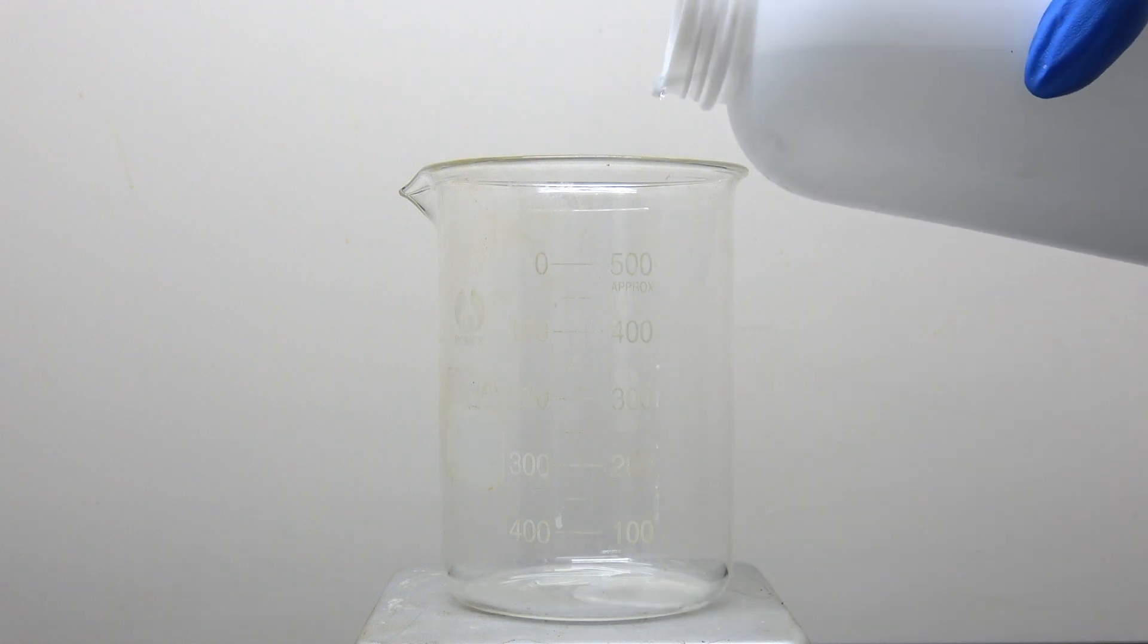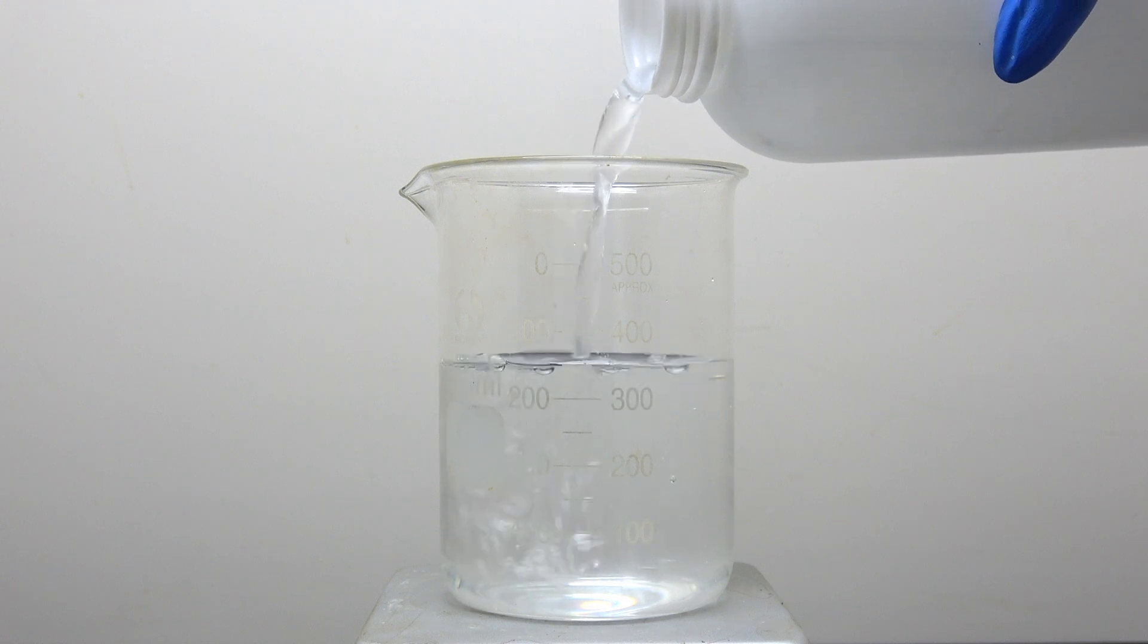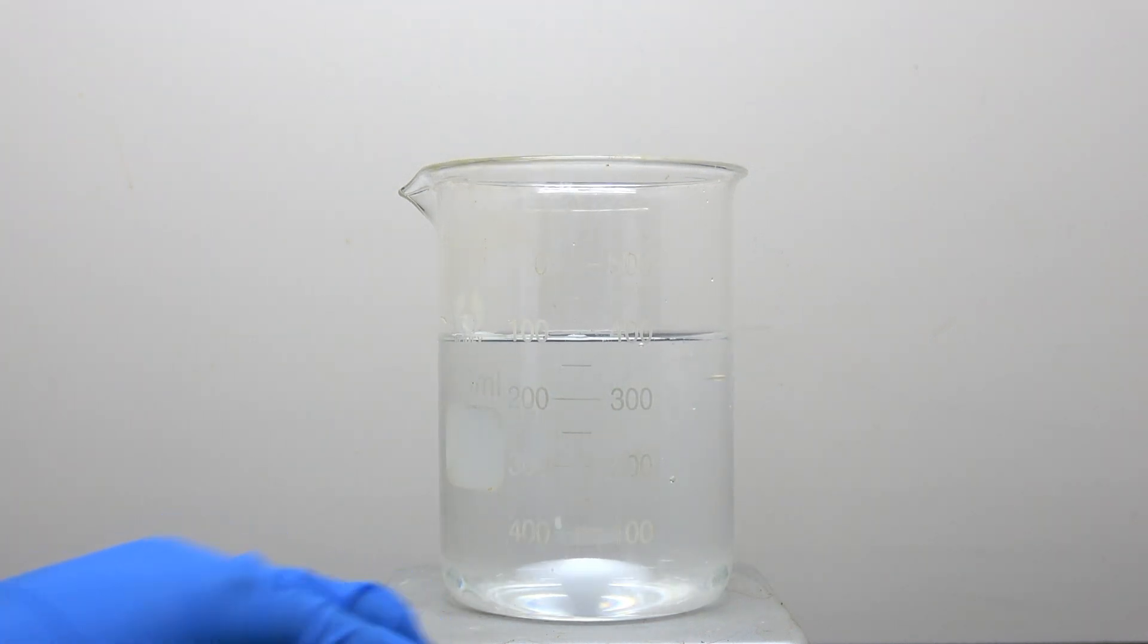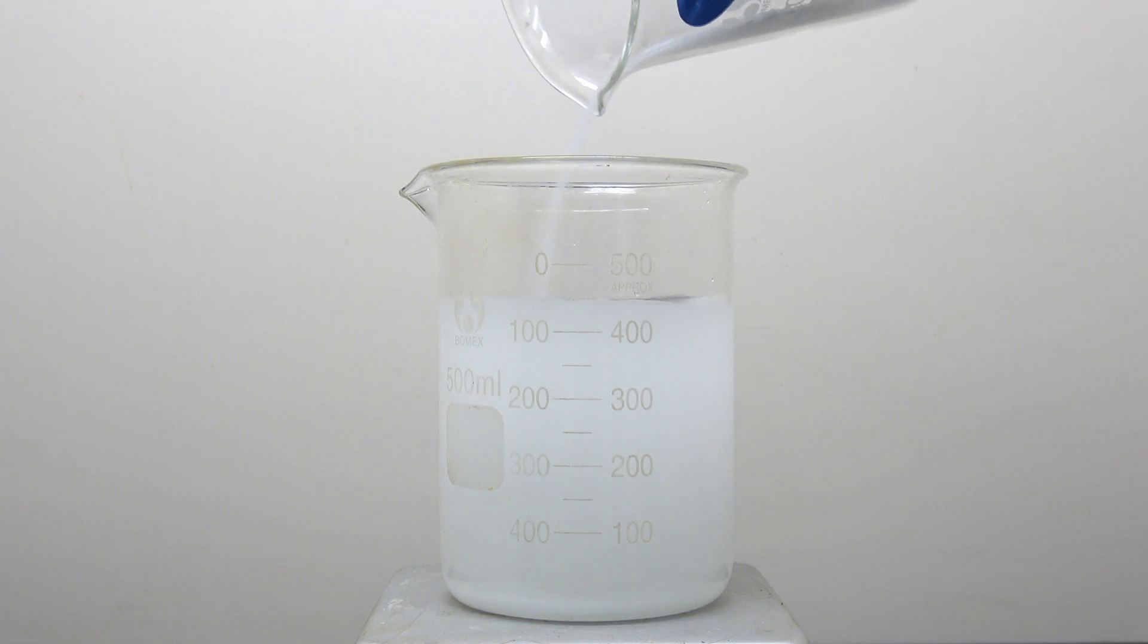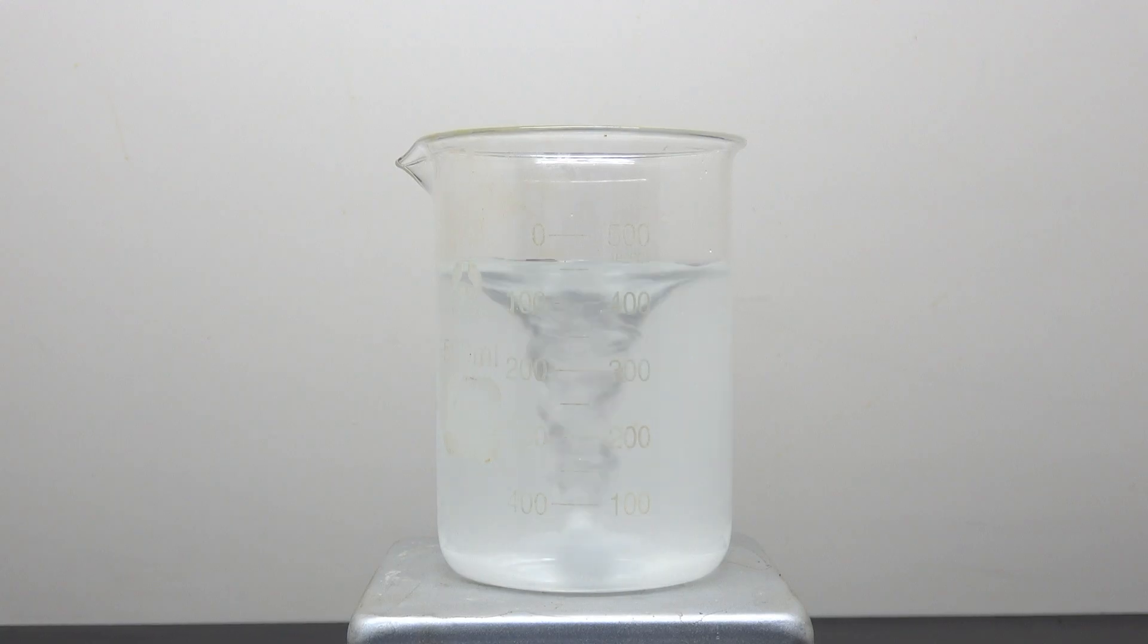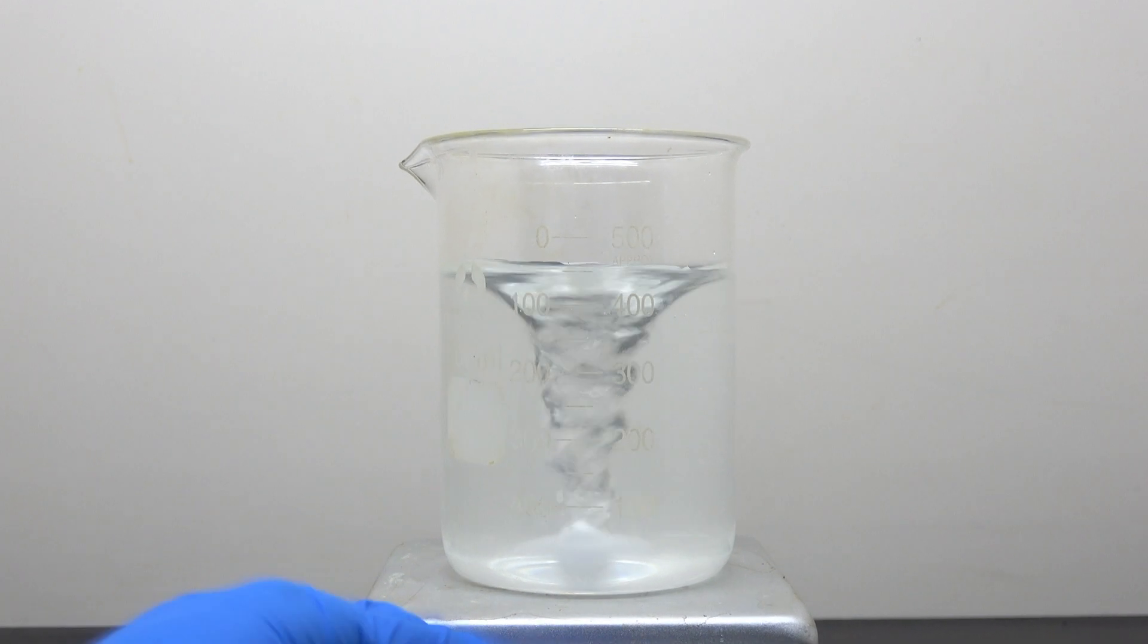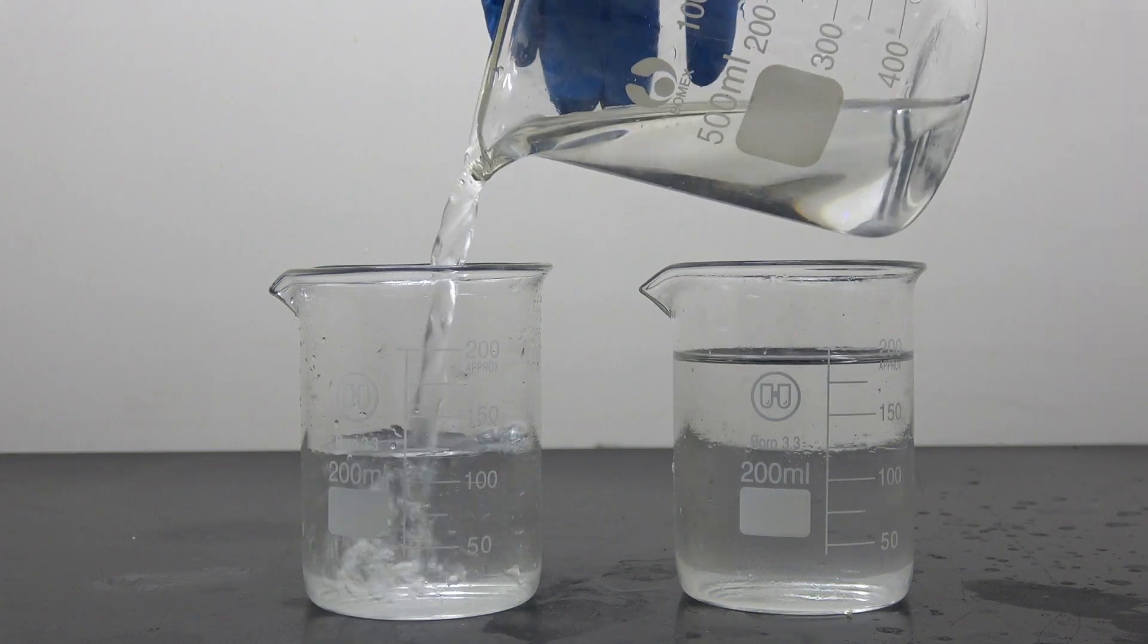To start things off, 400 milliliters of distilled water is poured into a beaker. Then I drop in a stir bar and turn on the stirring. Then 100 grams of sodium bromide is gradually added into the water. Doing it this way reduces the likelihood of trapping the stir bar. After everything dissolved, I turn off the stirring and distribute the solution into two smaller beakers.